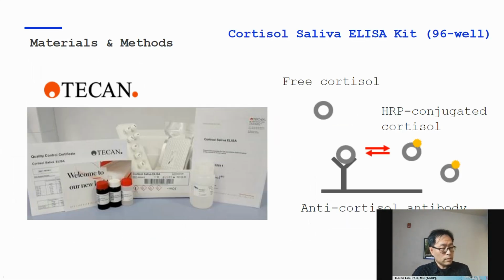We did another ELISA, which is a competitive ELISA from Tecan. And in a competitive ELISA, a reference antigen is added to compete with the target antigen for the binding to the antibody. This reference antigen carries the enzyme responsible for the signal development.